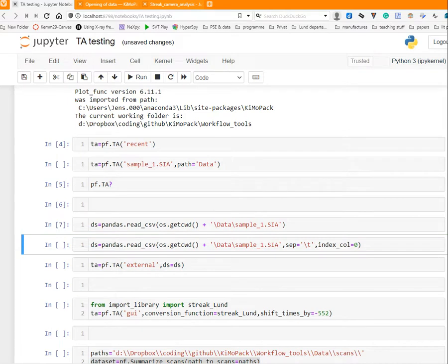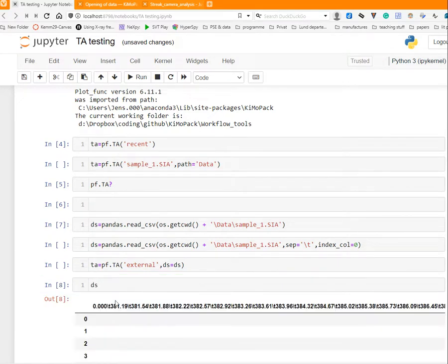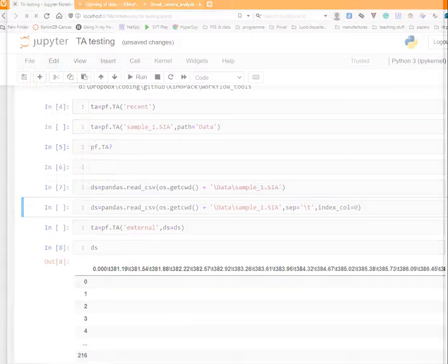For example, if you read in a file now and would look at this DS which we have just imported, it would not be perfectly separated. Finding out what options you need is often easiest by simply looking at the raw data.